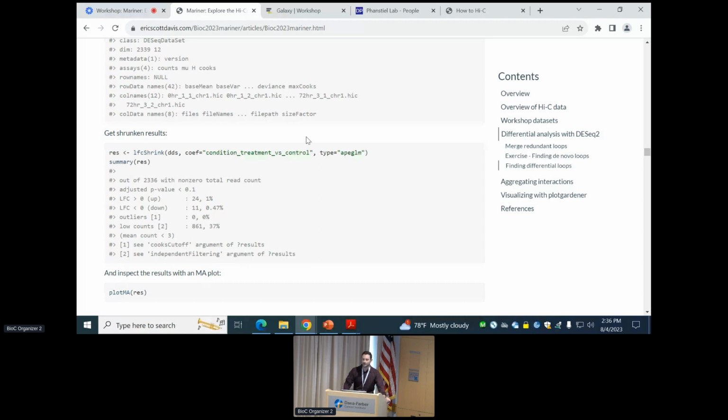But if you're, yes? Sorry, I have a question. Why do you use the DESeq tool, and did you try other differential expression software and how it performs?